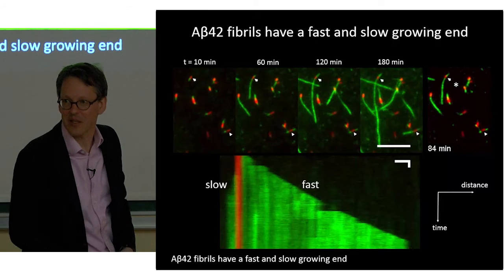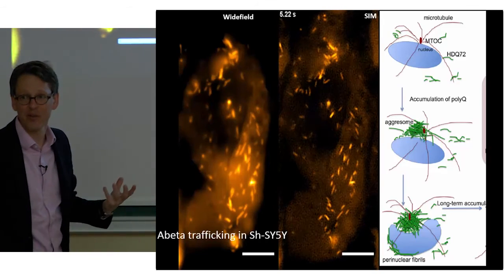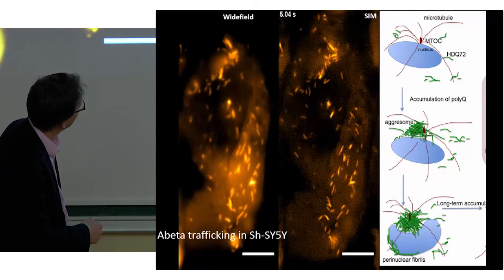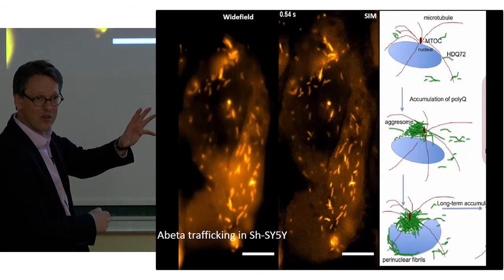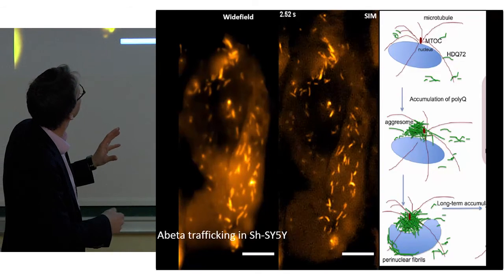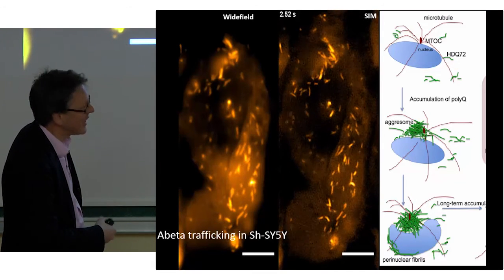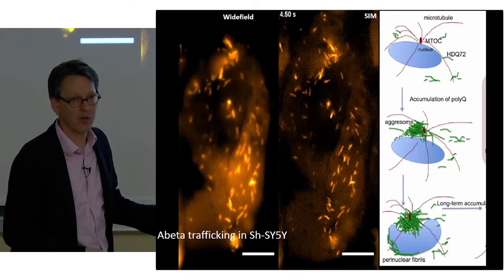What happens inside a cell? So let's look at that cell that's taking up these amyloid fibrils. And now we use structured illumination. We can see the individual fibrils inside the cell. These are amyloid beta fibrils. Just that protein, none of the other 10,000 proteins inside the cells are touched. It's just that A beta protein. And now look at this time scale. These are seconds. So we're taking here, this is at 12 hertz, 12 images per second super resolved.